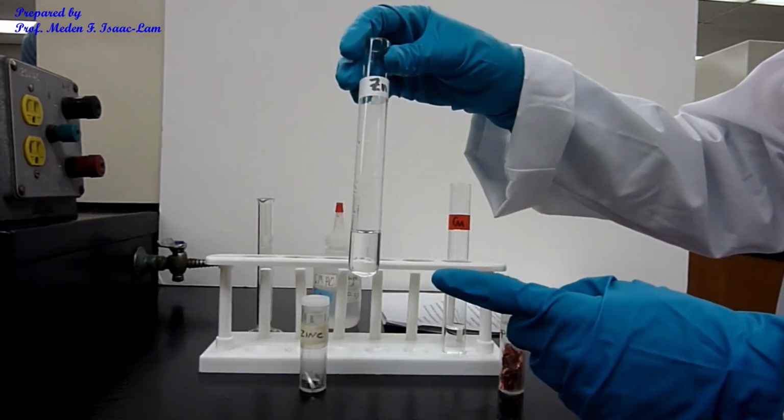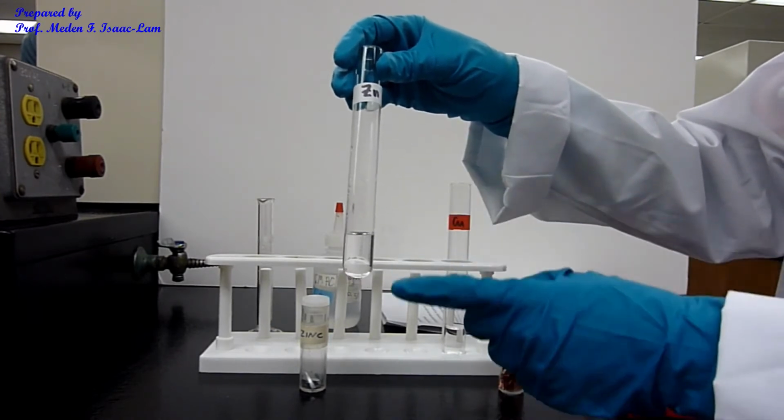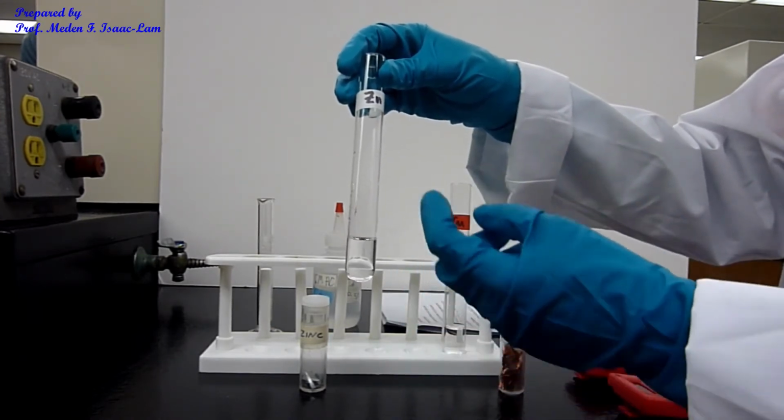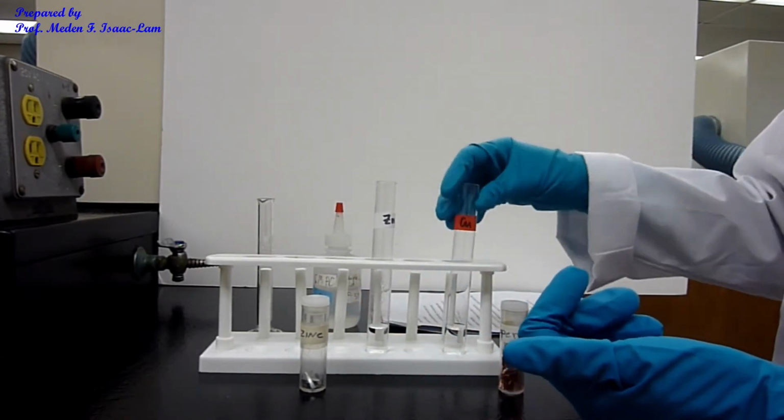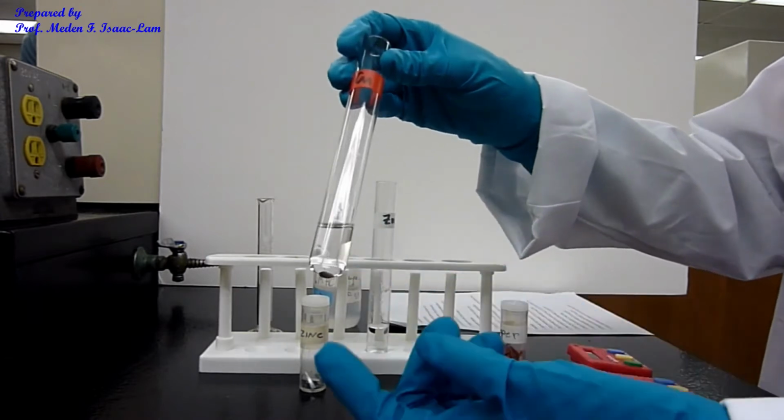So after 4 minutes and 15 seconds, it stopped bubbling, so it completely reacted. So we don't see the zinc anymore. However, for the copper, it's still unreactive.